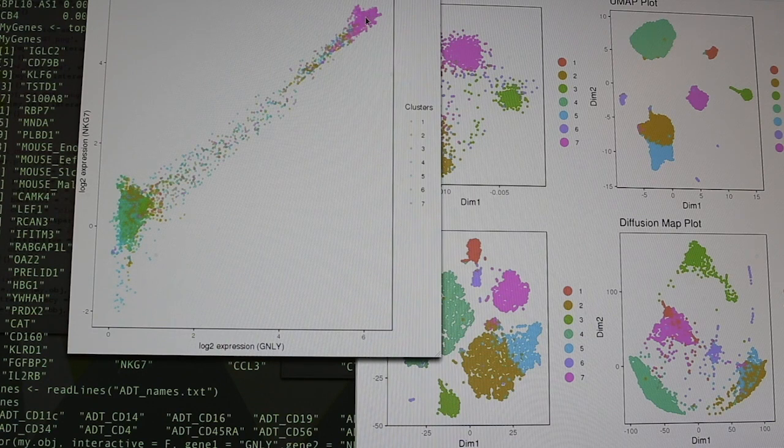And even if you don't want to cluster or do tSNE, if you just do this, you can say, okay, these are my natural killer cells. If you have some genes, or CD4, CD8, you can say, okay, up to here I trust these are my natural killer cells, and the bottom ones are not. You could do something like that as well.